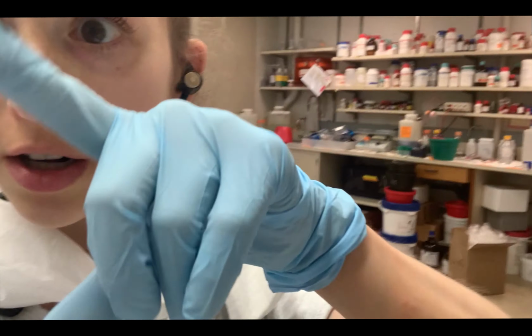Opposites attract, like charges repel. So the negative charges are going to repel each other, and the ATP won't stick to the paper. That's how you can wash off all the free ATP, because you don't want background, all the ATP that didn't get added to your protein. You want to make sure only your protein or your peptide is stuck on here, so only the hot stuff that's actually on the protein or peptide is on this paper.